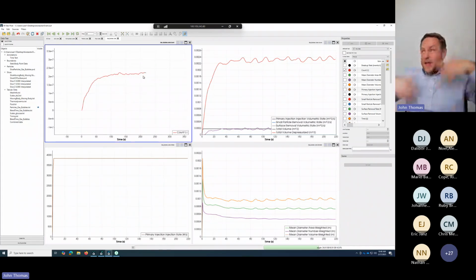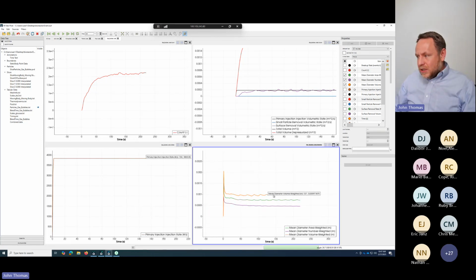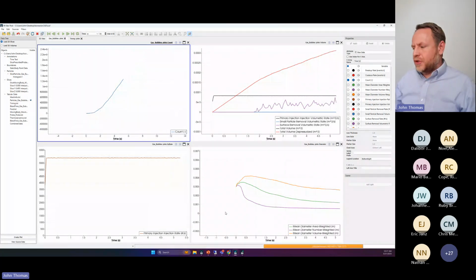It takes time for a cubic meter of fluid to be agitated for the bubble size to all converge, the size distribution to snap into place, and in fact, the addition rate to match the exit rate, which is indicative of a steady state simulation, at least for the bubble field. But as I'm looking at the sizes converging, the count converging, and the entrance and exit rate converging, once those all settle, I know my kLa will be constant. Okay. So this guy is not going to get there in the course of our discussion now, but you understand how these gears are turning.